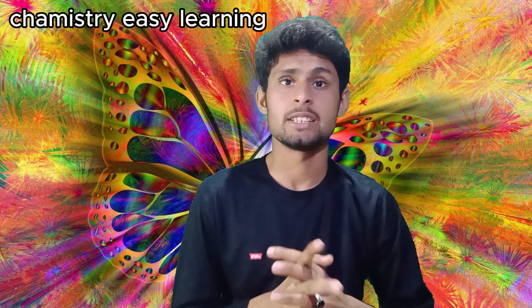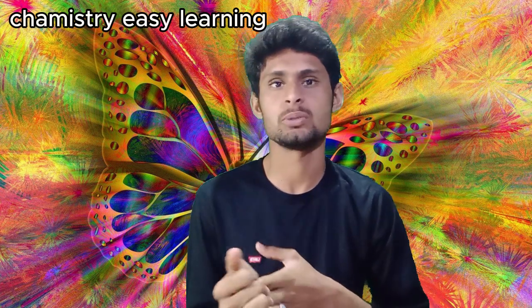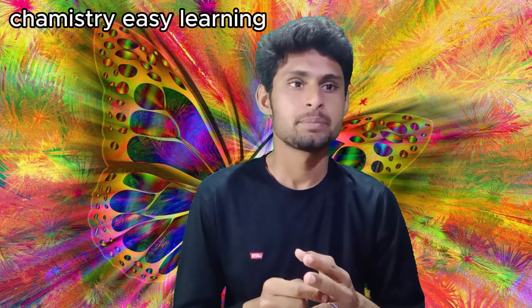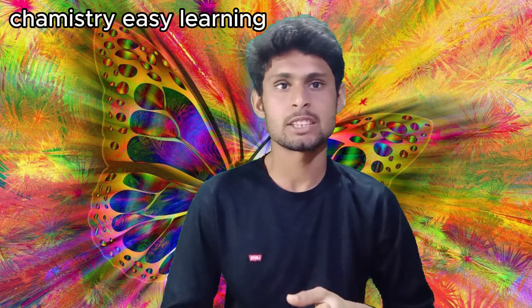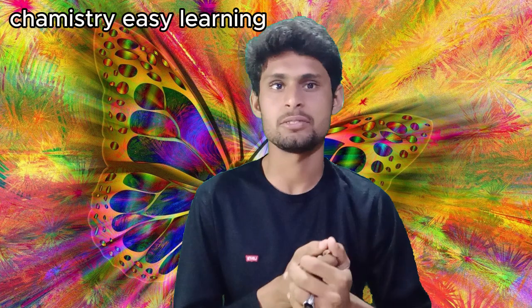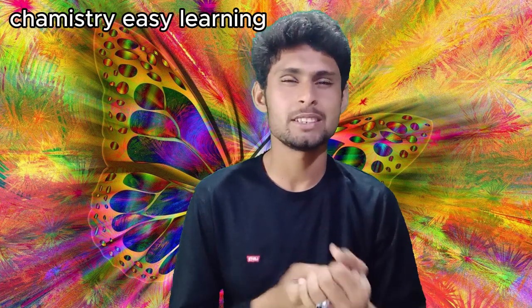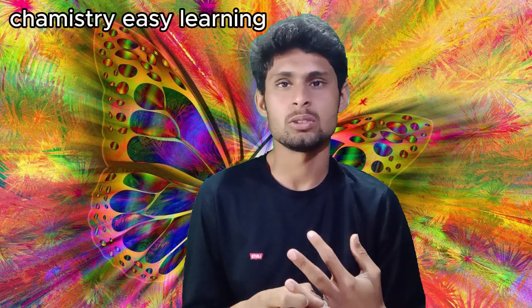Chromatography is one of several separation techniques defined as differential migration from a narrow initial zone. Electrophoresis is another member of this group. In this case, the driving force is an electrical field, which exerts different forces on solutes of different ionic charge. The resistive force is the viscosity of a non-flowing solvent. The combination of these forces yields ion mobilities peculiar to each solute.